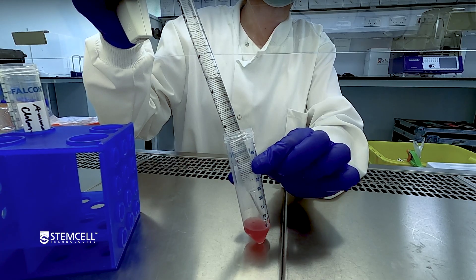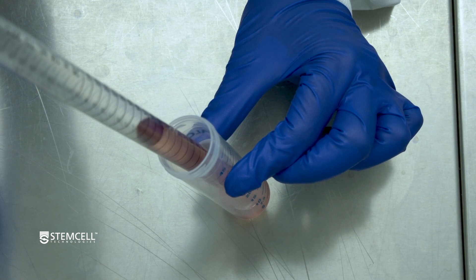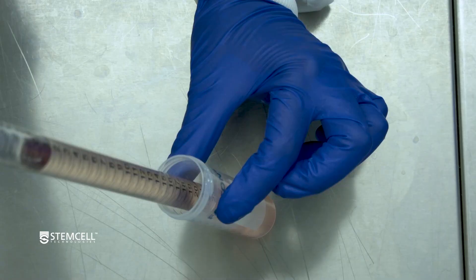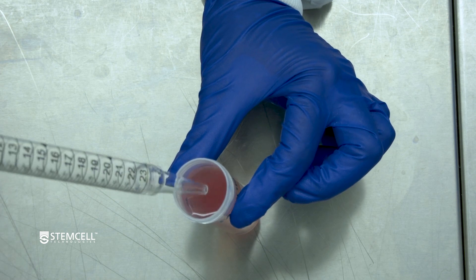Add 20 ml of ammonium chloride solution to the cell pellet and mix gently. Incubate at room temperature for 5 minutes. Top up to 50 ml with PBS containing 2% FBS and mix gently.